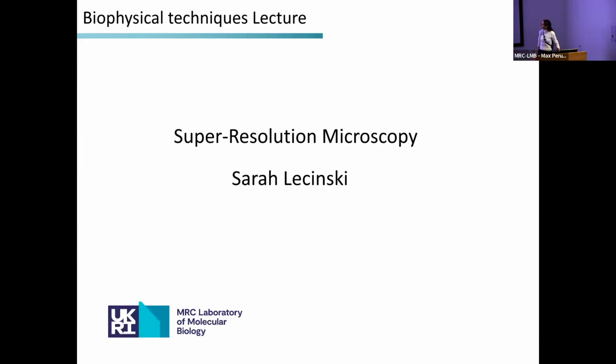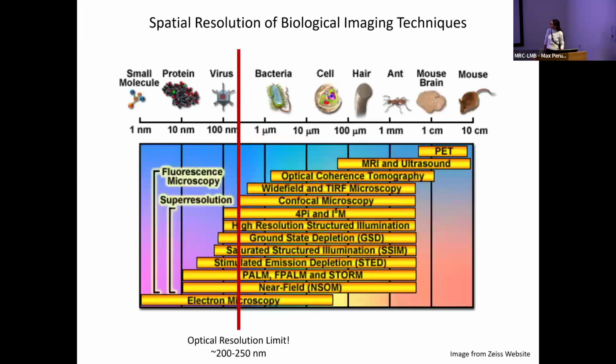So today I will talk about super resolution microscopy. And you can see here, in this graph, you have a whole range of fluorescence microscopy techniques. They allow you to image across various biological scales.